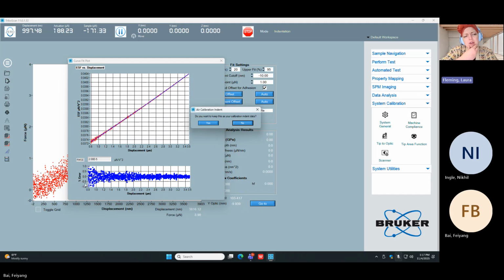I suppose we've never really used that as any sort of barometer of the air cal. Everything else is what we're looking at. It's good that you picked up on the low frequency noise getting into the system. We can see a little bit of vibrations, but it's about what I would expect for this system. I know that your system is passing noise spec, so I'm not really concerned about it. It seems pretty standard for this instrument.